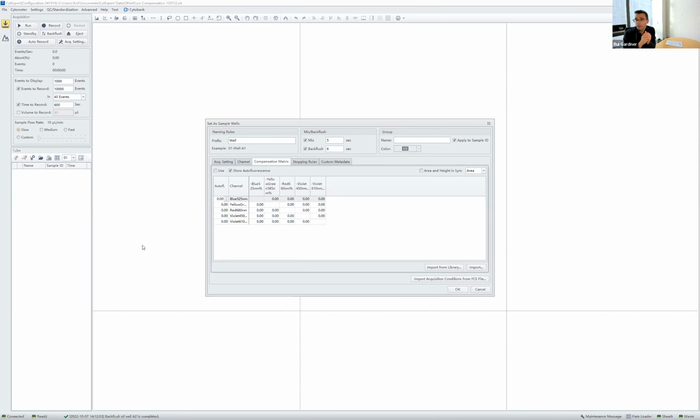The other thing is, if you're struggling with compensation with this software, you can always load the data into another software and see if the problem is coming from the actual software, which I doubt. It depends on how it's calculating those differences in gains, if you are using different gains for the different controls. But if you're not, then the calculation of compensation should be really straightforward. Every software should be able to do that without any issue. You may have problems because the controls are not ideal, but that's a different thing; the calculation itself should be straightforward. Any software would do that.